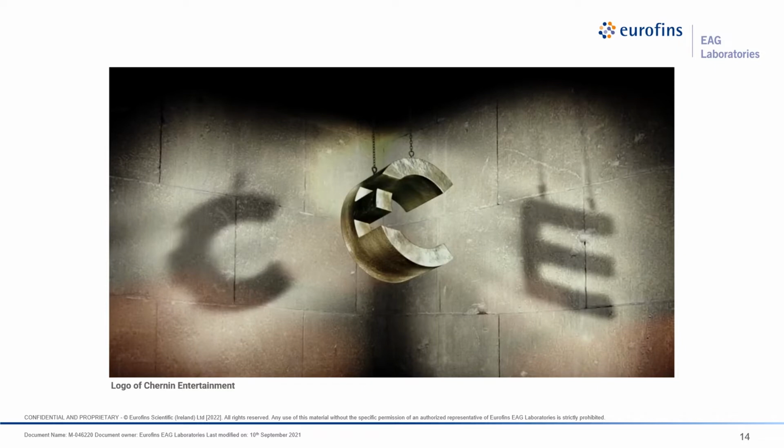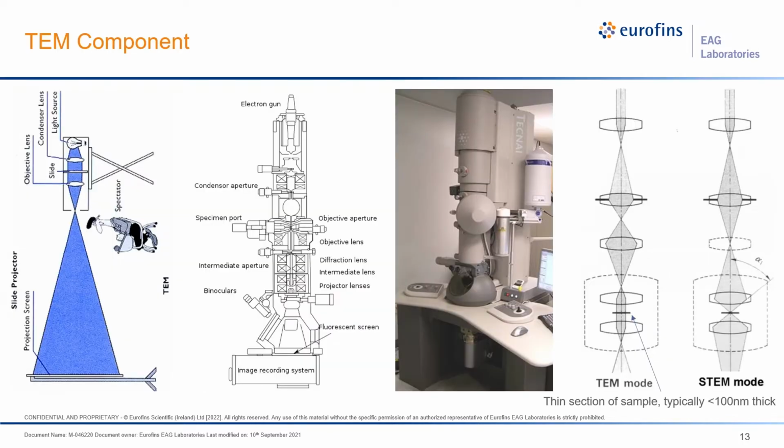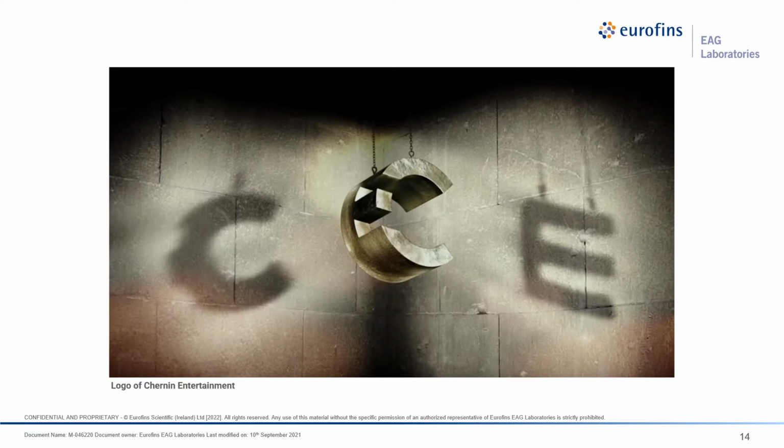All right. So if we go back to this slide, this thin slice is actually a feature that has a certain thickness. So basically, what I will say is that TEM, in a lot of senses, is a two-dimensional projection of a three-dimensional object, right? So for example, in this case, this company produced Age of Apes, right? So this is a pretty good logo I can show you. If you take a look at the same object from a different orientation, you will see a different projection, right? The same type of effect actually exists in TEM.